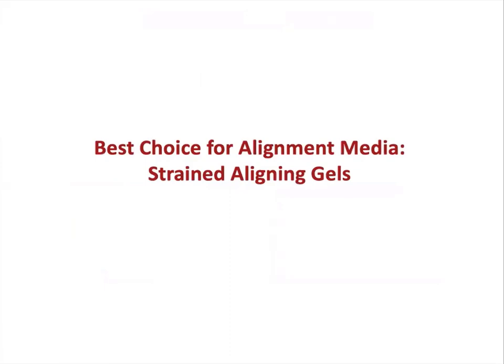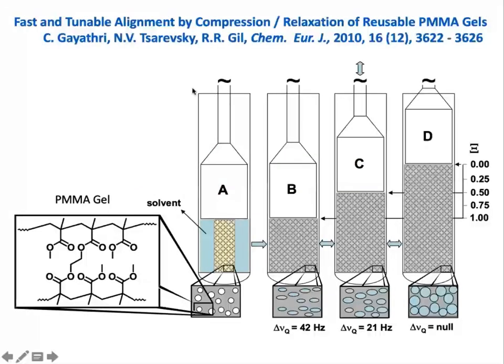I've been working on this probably since 2007. My first paper was in 2008, on the development of something that people can use. So the idea is to develop a methodology that I hope becomes more mainstream. And in 2010, we proposed this compression method in which we use a plunger, and then we were swelling a gel, and then we compress or relax the gel, as you can see here, and then you get cavities for compression, and then here, this one, you can tell this is isotropic.